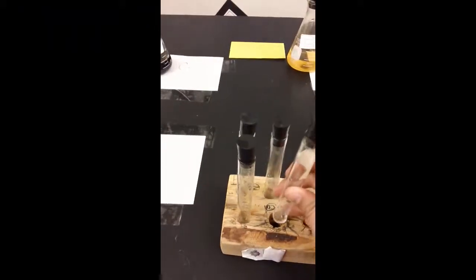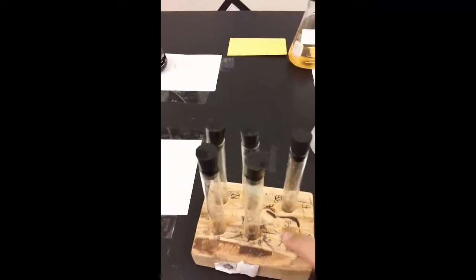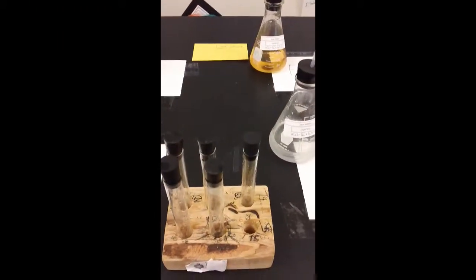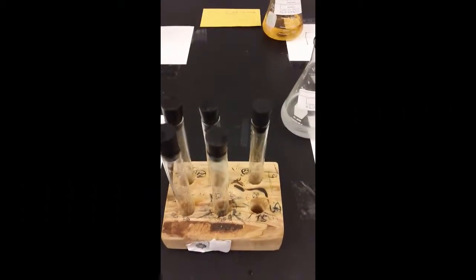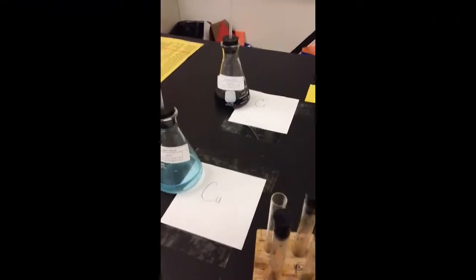So what I'm going to do is I'm going to put 1 milliliter of each of these knowns into my test tubes, which should be clean, and I want to make sure that I label which test tube is which one, so that when I go out to my tests and I make my observations, I can be really accurate with which observation goes with which chemical. So I'm going to do that one now. So I have here, I'm going to start here.